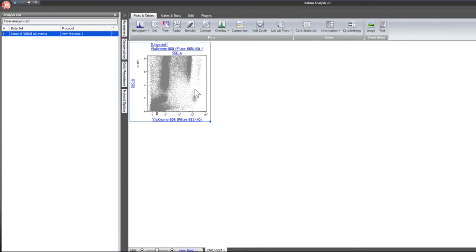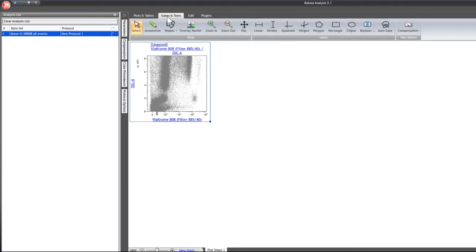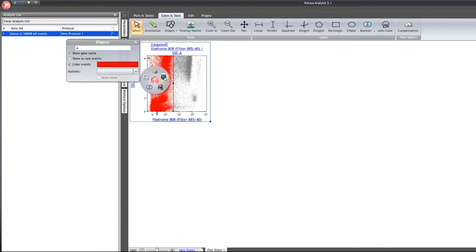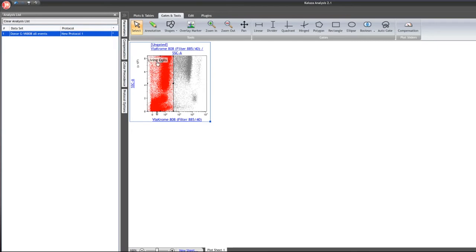Once the plot is created, to create a gate focusing only on living cells, go to gates and tools and select from the different gate types available. I'm going to choose a rectangular gate and click to insert it onto the plot, grabbing all of the living cells and adjusting it. After the gate is created, right-click on the gate and under the display option you can change the gate name and gate color. Click enter and the gate name updates. You can also drag the gate label anywhere on the plot.